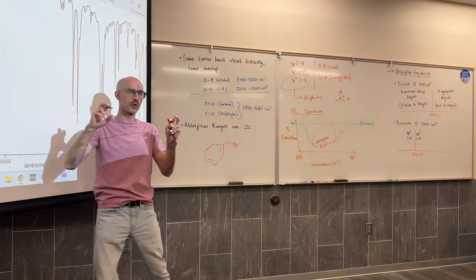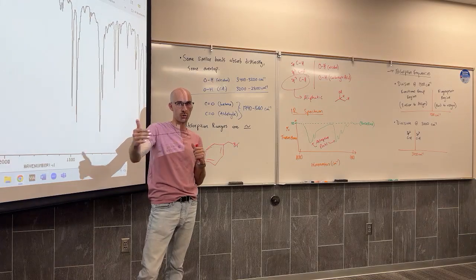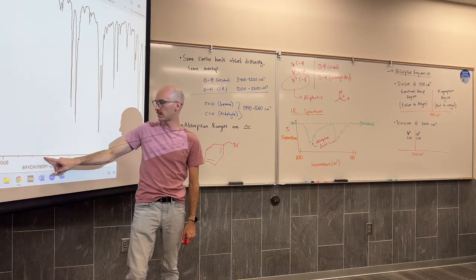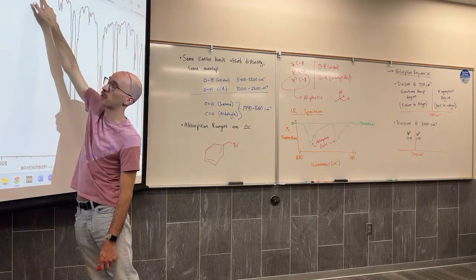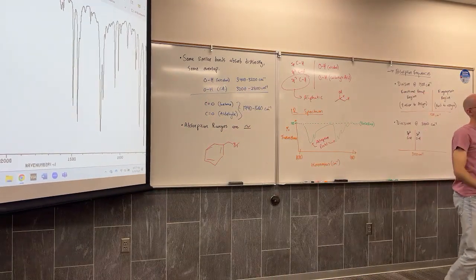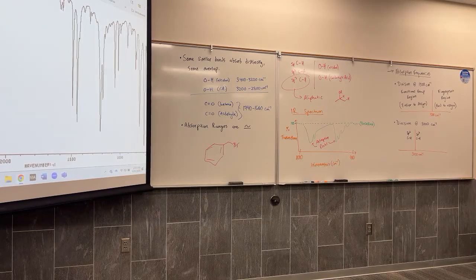And the overtones, which is just a fancy way of saying resonance absorption, show up here, 1900 to 1700. And if I bring that straight up, I see these several weak absorptions giving me evidence of my aromatic overtones. Will those two peaks at 1500 be the nitro?